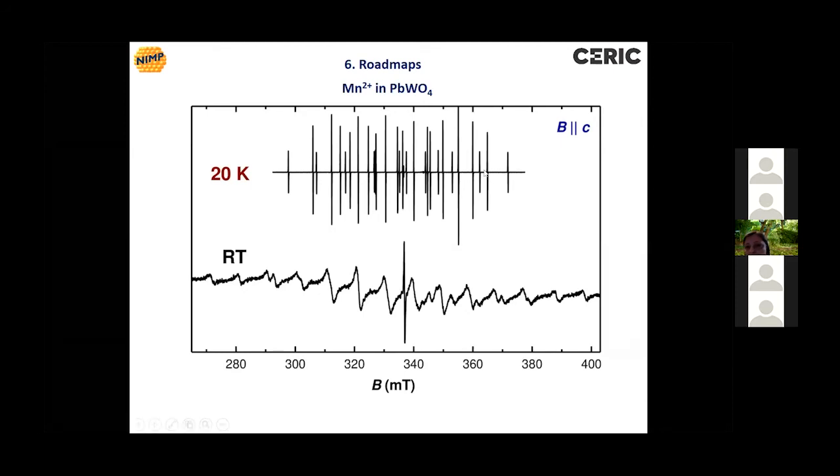And then you separate in the same way the other most exterior group, which correspond to MS transitions. So here it is from -5 halves to -3 halves, and here you will have from plus 5 halves to plus 3 halves. And so you identify those 6 hyperfine lines based on their intensity.